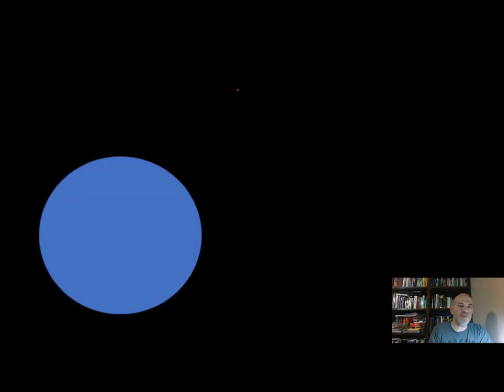So let's start with a simple analogy here. Let's say we have a plate, and this plate here is going to be an analogy to what you see under the microscope. When you're looking under the microscope, the field that you look at, or what you're able to see, looks round in structure. So here we have a round plate for our analogy. And let's say that this plate is about 12 inches, which is approximately 30 centimeters in diameter all the way across. And let's say we put some fruit on there.